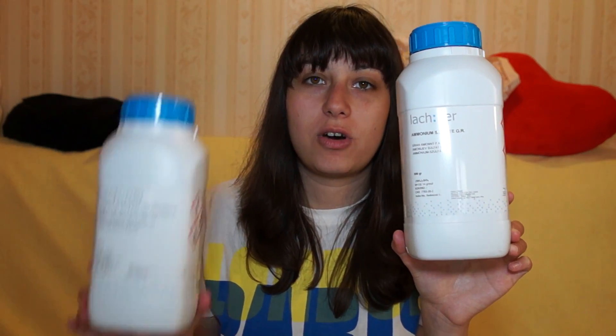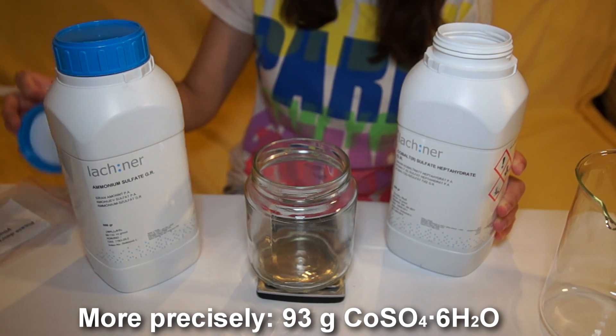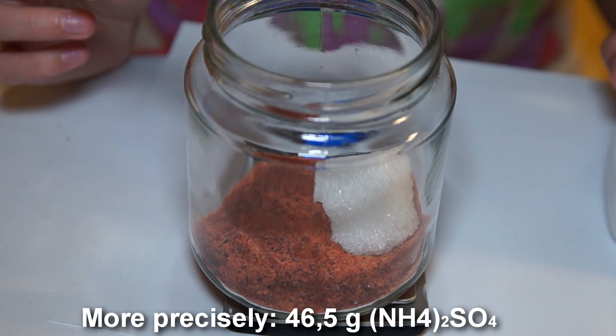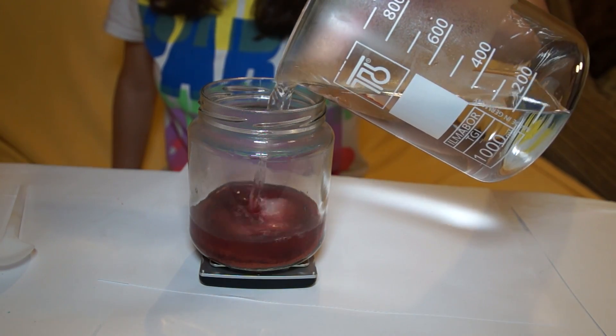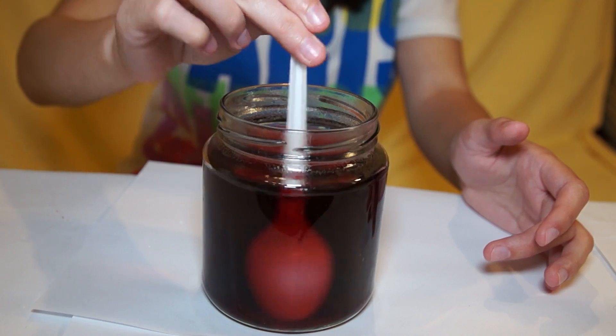Hello everyone, today I will tell you how to grow beautiful red crystals of salt at home. For this we need ammonium sulfate and cobalt sulfate. To begin, let's take a glass and weigh 53.14 grams of cobalt sulfate and 26.6 grams of ammonium sulfate. Thereafter, pour 400 milliliters of hot water into the vessel.